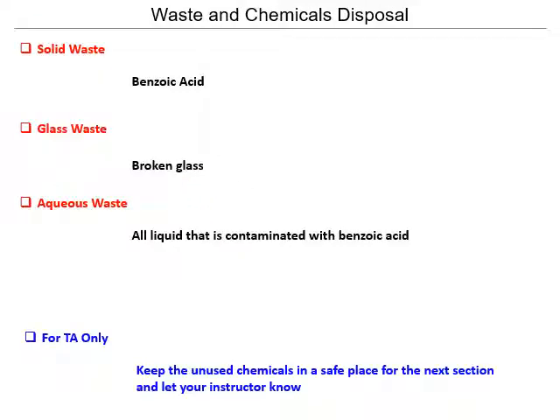And finally, we have the waste and chemicals disposal. Think about the chemicals that you use today, especially, for example, the base that you use today. What was the base that you used, and where can you dispose of it? Was it solid? Was it liquid?